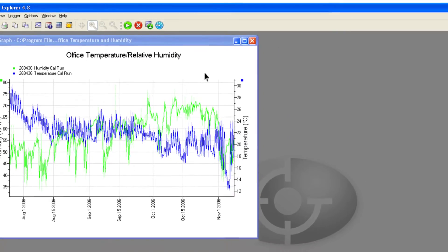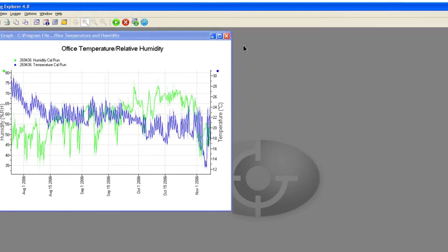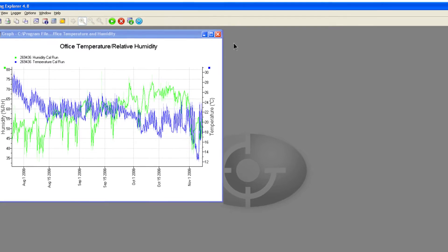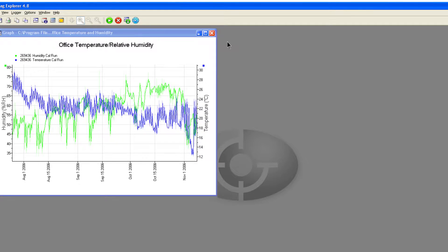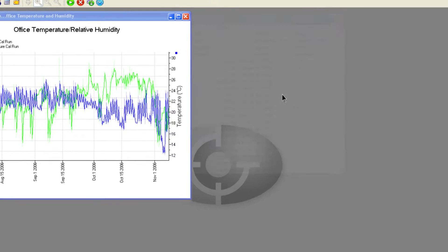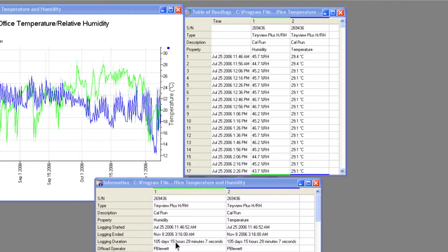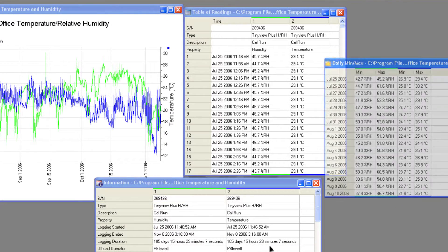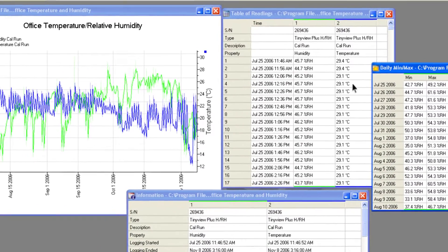Data from the logger is initially displayed as a graph that automatically scales itself to a suitable range for the data recorded. Data can also be displayed as a table of readings, as summary information and as a table of daily minimum and maximum readings.